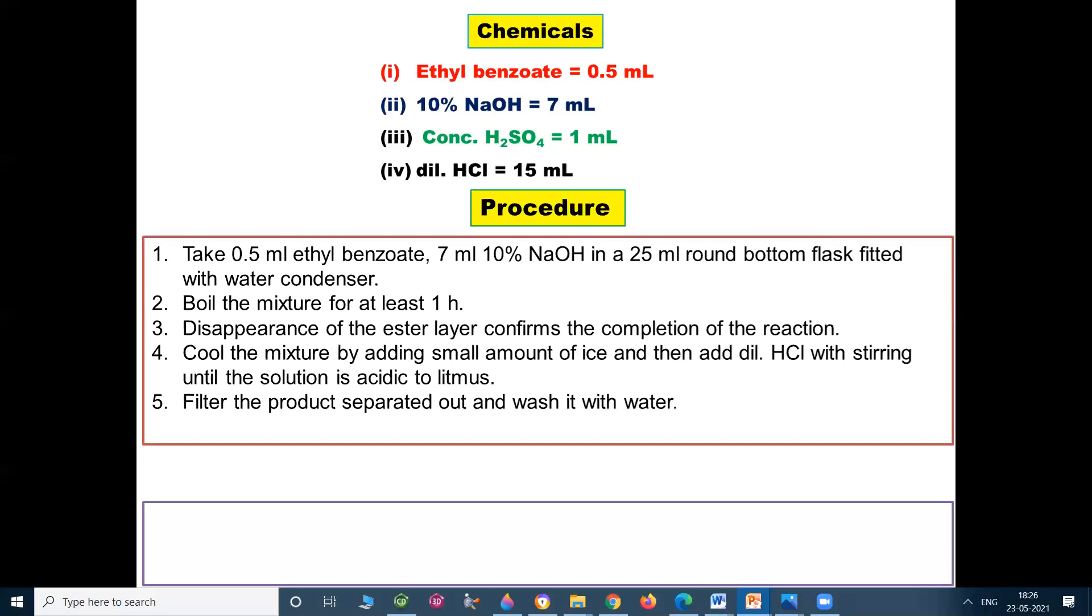Wash it with water. Dry the product. Record the practical yield and recrystallize it.